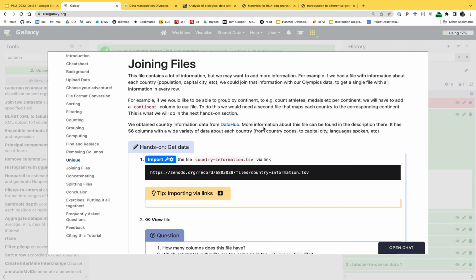However, in biology, because we often deal with intervals, we have a gene which is on chromosome 1, located between position 10 and 100. And we have, for example, a variant, or, I don't know, a ChIP-seq peak with coordinates, say, 20 and 25. So we can join these two, and they will be joined if that ChIP-seq peak is inside that gene. It's called genomic arithmetic, and this is a different kind of join. It's a kind of join which we're not doing right now. Right now, it's going to be joining on a single column. I'm going to talk about interval logic. So this is where you deal with intervals.